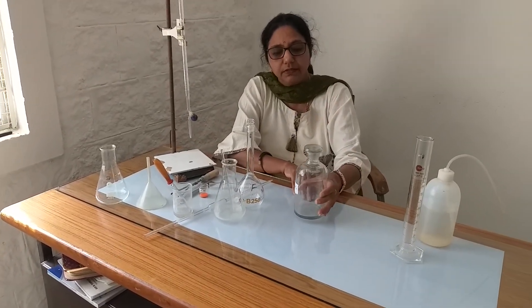This is called the reagent bottle. In the reagent bottles, the reagents are kept — whatever reagents are required in the lab, such as solutions of potassium dichromate, sodium chloride, sodium hydroxide, potassium hydroxide, or any other solution. They are also called sample bottles.